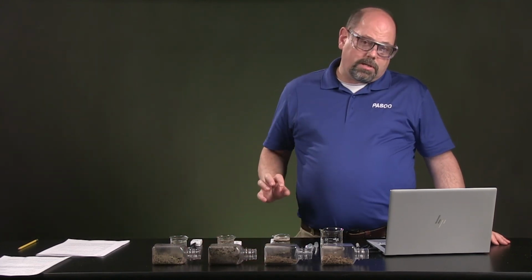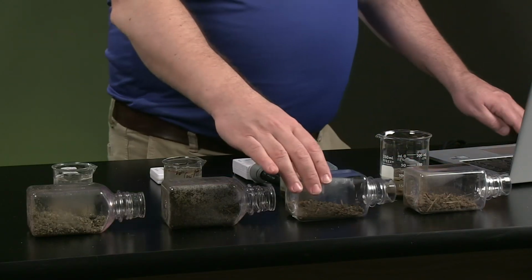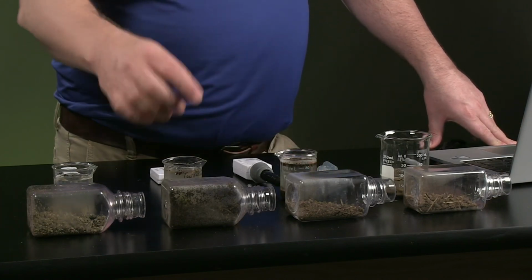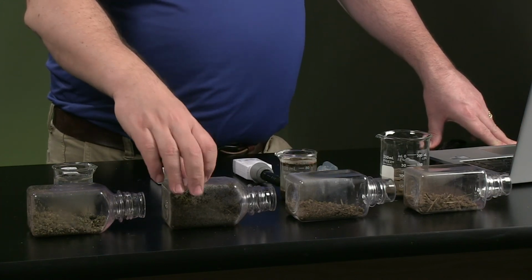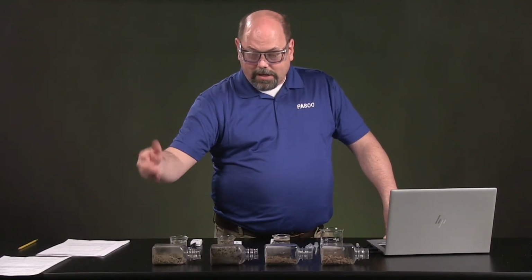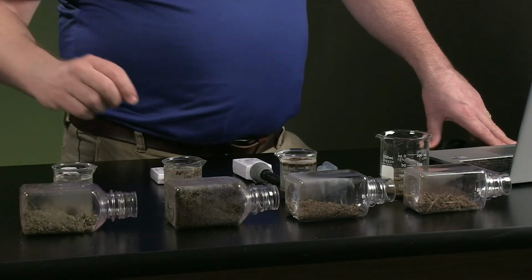So when you're done, come to a conclusion based on what you see and what you've measured, or if you want to use our samples, all 4 of these soils, again, from grasslands. We took some sample of soil underneath the forest, pine forest, so it had a bunch of pine needles there. This is the garden soil that was probably used, and soil came in like peat that was enriched. And the last one was the sandier soil from the creek bottom.